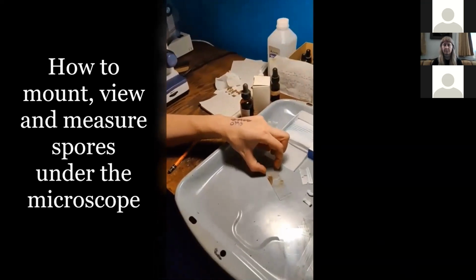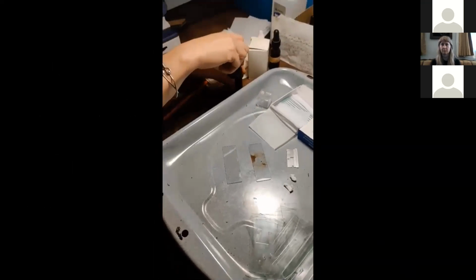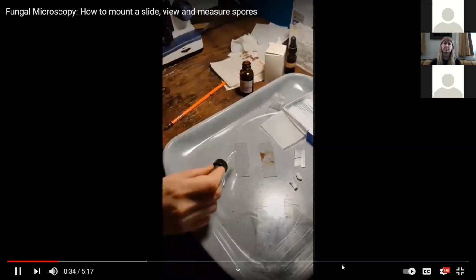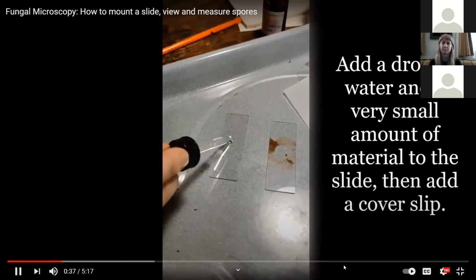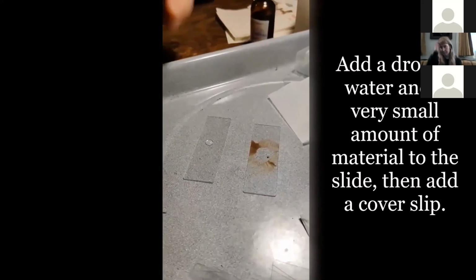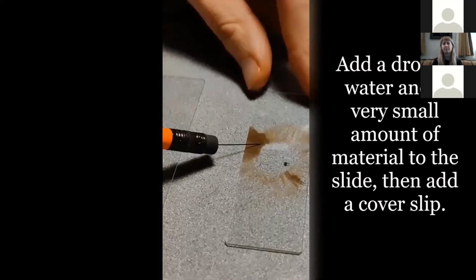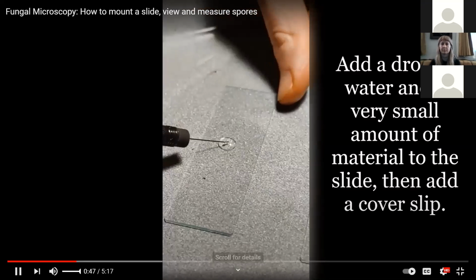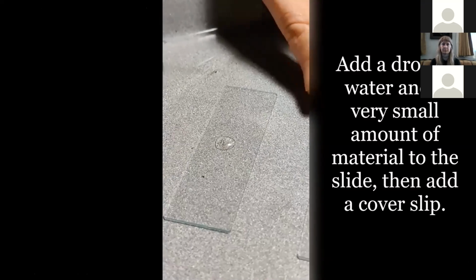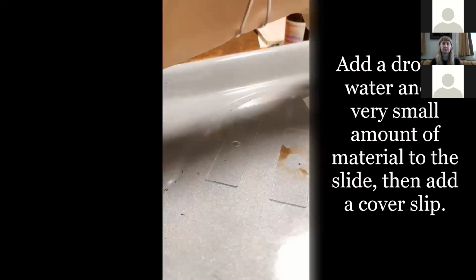Here I have a spore print. This is from an agaricus that I did on a slide, and I'm gonna put some of those spores under the microscope. Okay. So first I've got water, and I put a drop of water on the slide. Okay, then I'm going to use my little doohickey and scrape some spores. And I can see that I've got some on the drop.